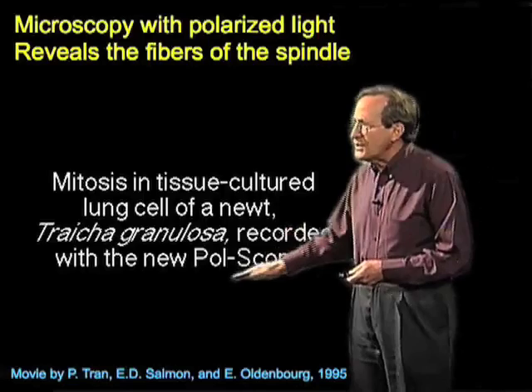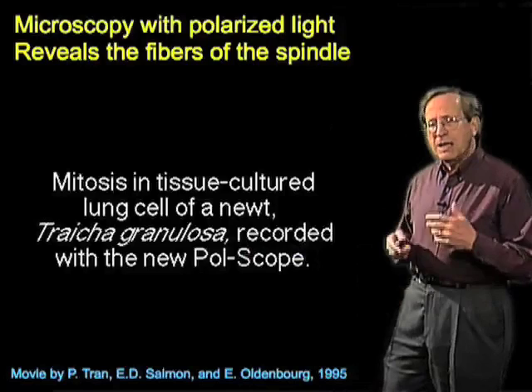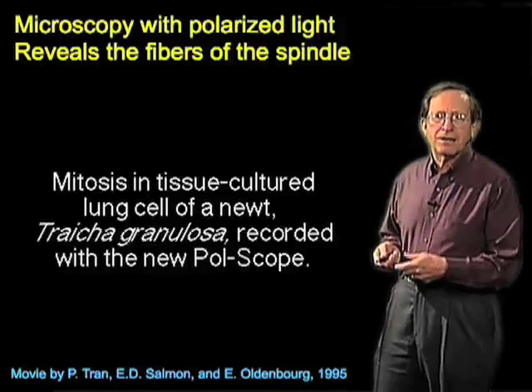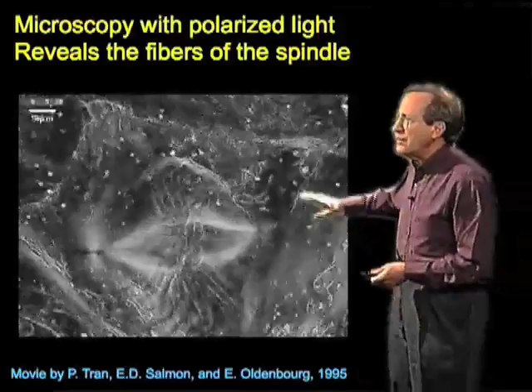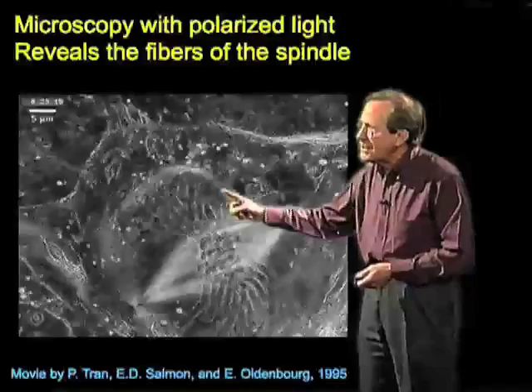This is a movie taken with a brand new kind of polarization microscope which gives a brightness reflecting the way in which polarized light is interacting with the cell, in such a fashion that it doesn't depend on the orientation of the object relative to the plane of polarization. This turns out to be important for getting a clear image, and the brightness is the polarization optical image of the spindle.